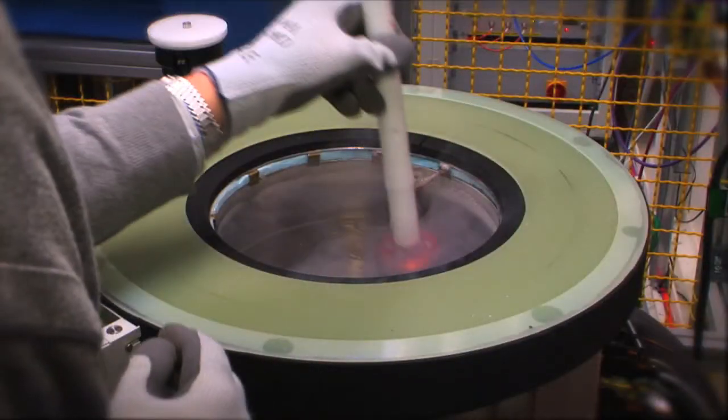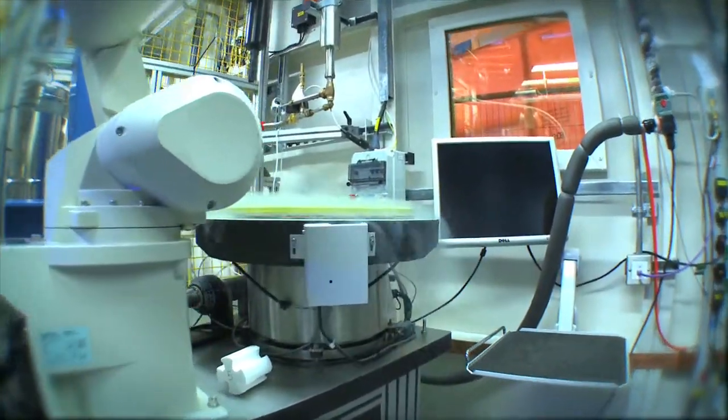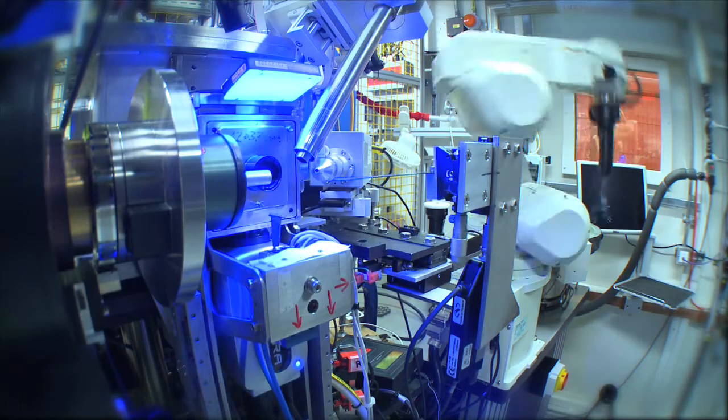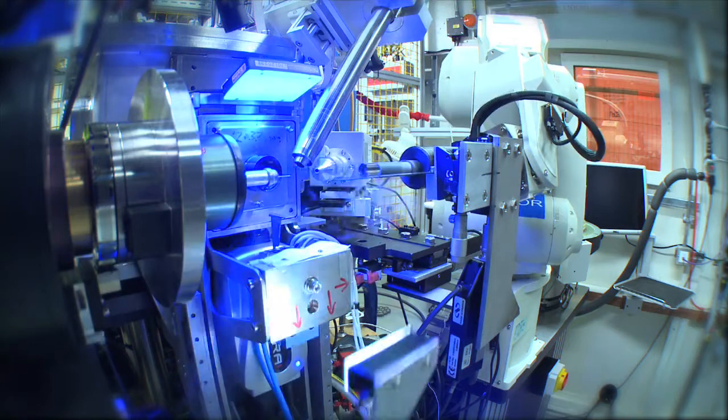Typically our users when they come to the Diamond MX beamlines would have their samples pre-frozen. They bring them in sample pucks. These pucks can then be loaded into the robot dewar, which is a container filled with liquid nitrogen which keeps them at cryogenic temperatures. We then have an automatic sample changer to load their samples, which means that they're as efficient as possible in their experiments.